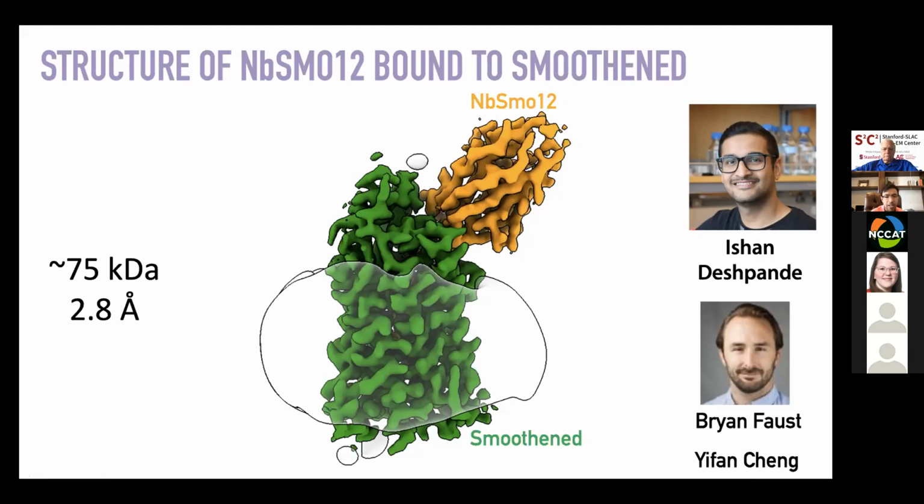The challenge with ICL3 fusions is that there are basically 2 points of attachment. So getting that entire thing to be rigid, where the mass of the fusion protein is driving alignment of the GPCR, is really quite challenging. In my lab, we've tried this quite a bit. It's worked to some extent. We've heard rumors where this has worked a little bit better for others. So it's a very bespoke thing for each specific project.